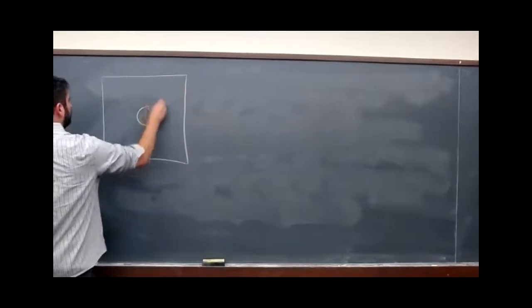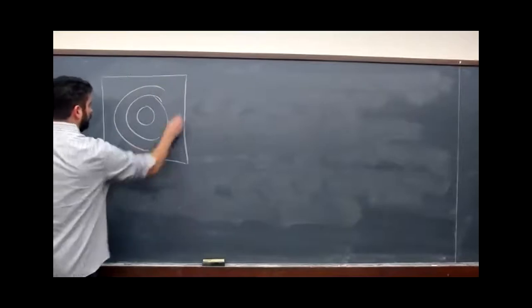So we have our detector, and we have some Debye rings.